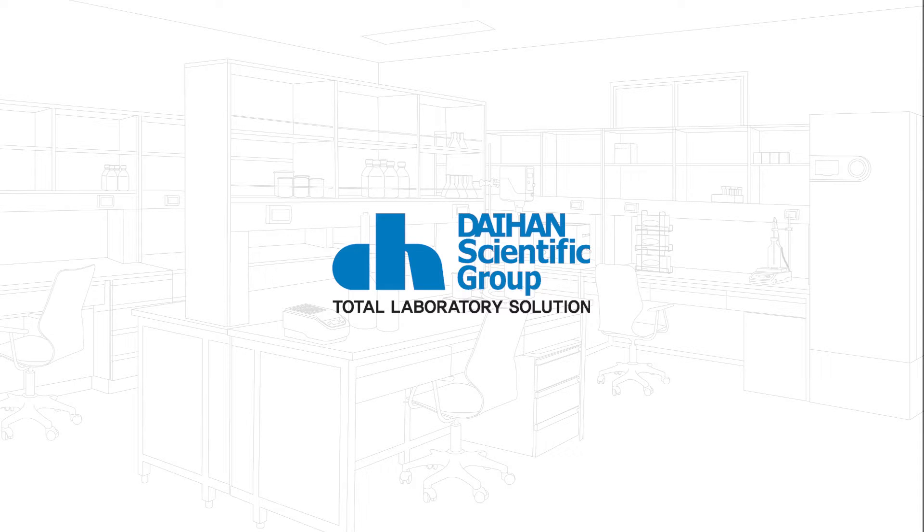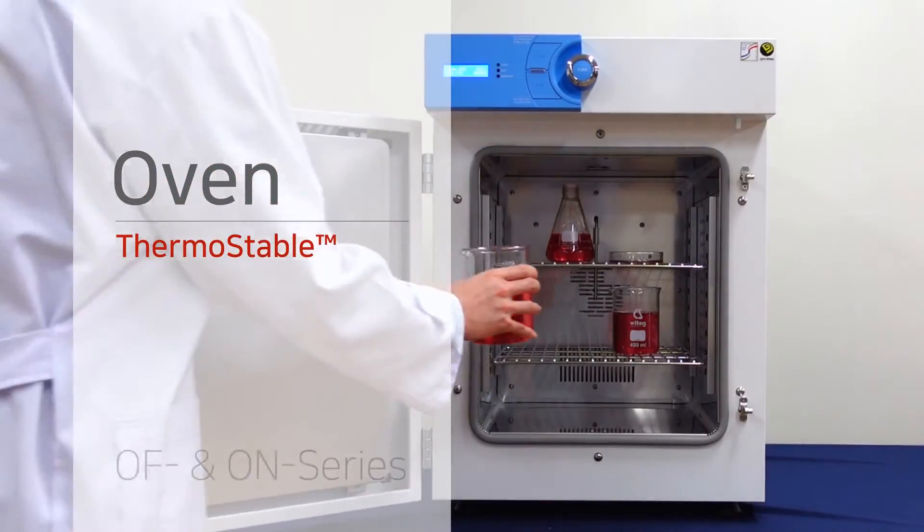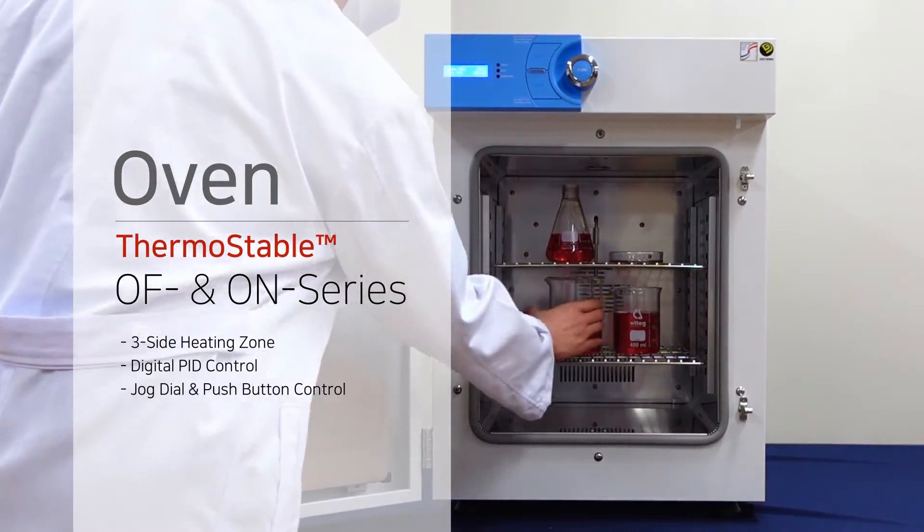DAIHAN Scientific is a total laboratory solution provider in Korea. Hello everyone, I'd like to introduce the DAIHAN Scientific drying oven.